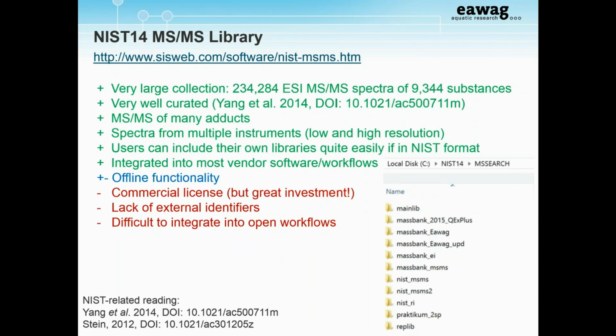It's very well curated. They've actually documented this in quite a nice paper. They also have MS-MS of many adducts, and like I've mentioned, spectra from multiple instruments. This makes it actually a nice collection. Users can integrate your own library very easily into the NIST software if you have it in the NIST format, and I actually do this, for instance, for the MassBank spectra, as you can see here. And this is also integrated into most vendor software and workflows.